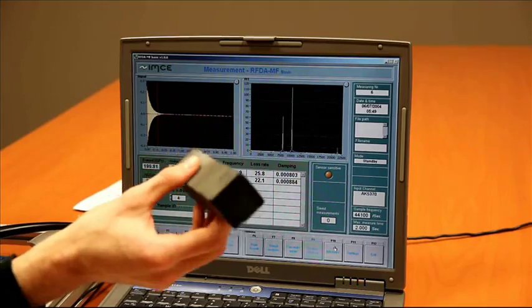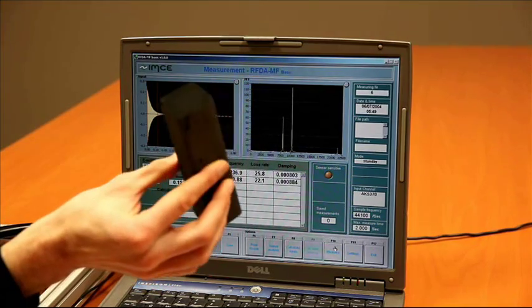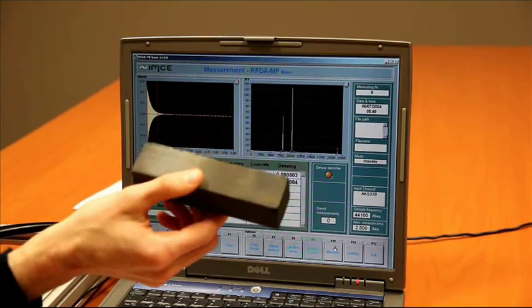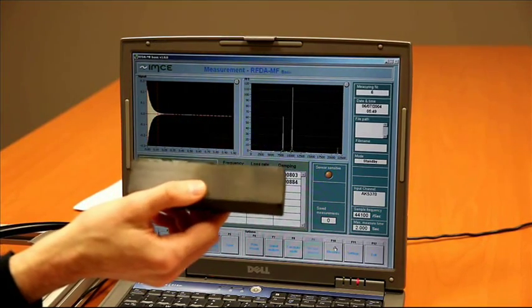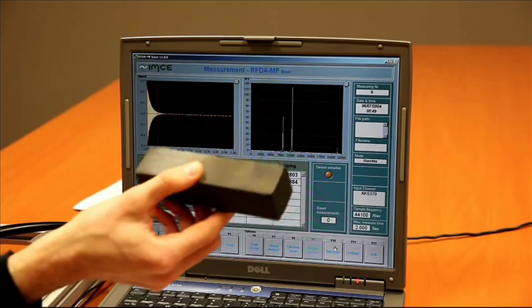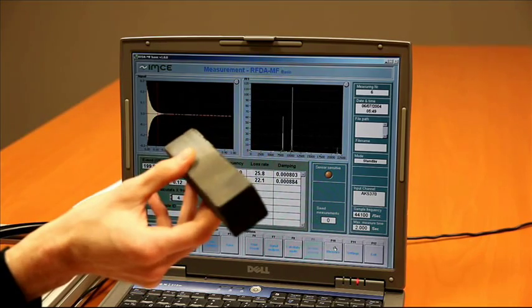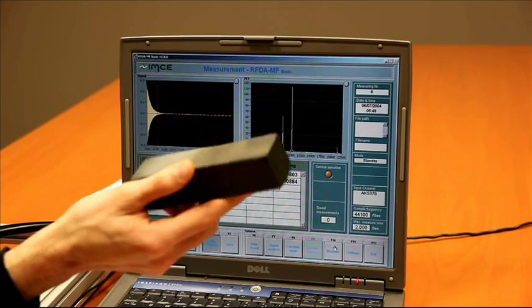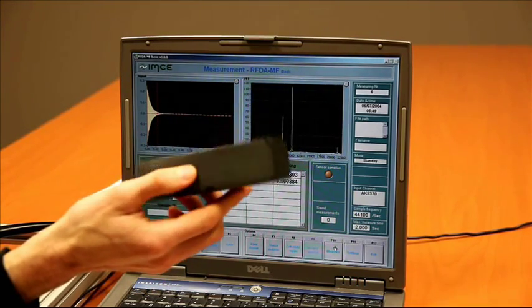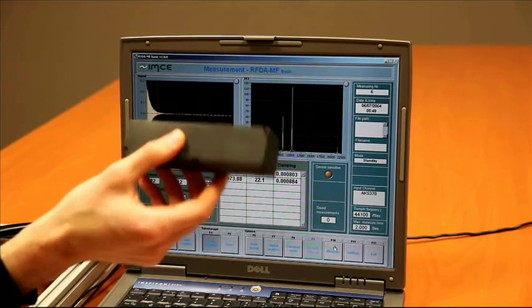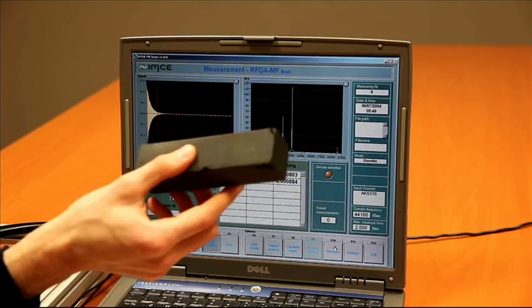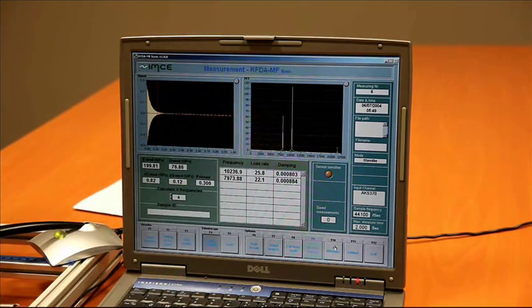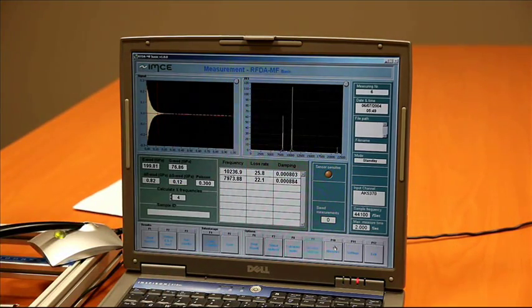Here's another example, very porous ceramic material. This is a diesel particle filter. Also very difficult to measure with other techniques, but we get very good results with the RFDA basic system.